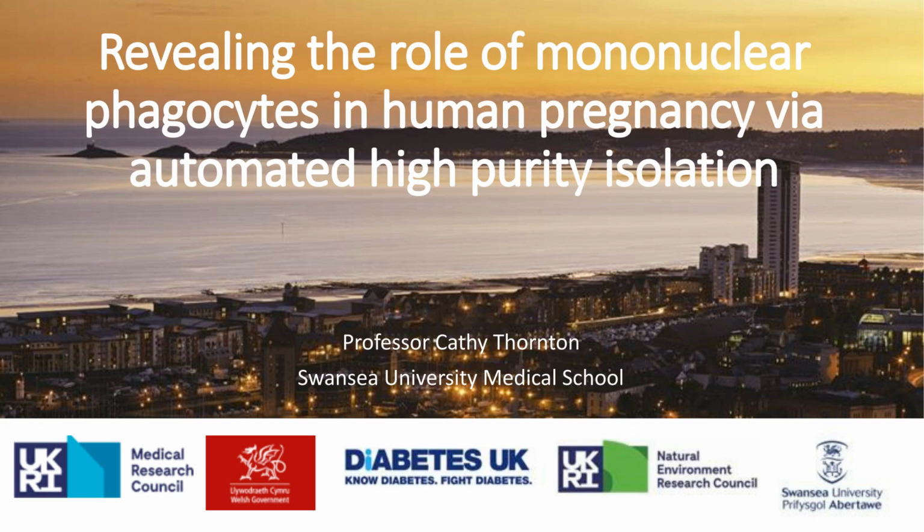I'm going to give an example of how we use that in our laboratory now. I'm focusing on our work studying mononuclear phagocytes in human pregnancy, using that automated high purity isolation as kind of the core to what we do.